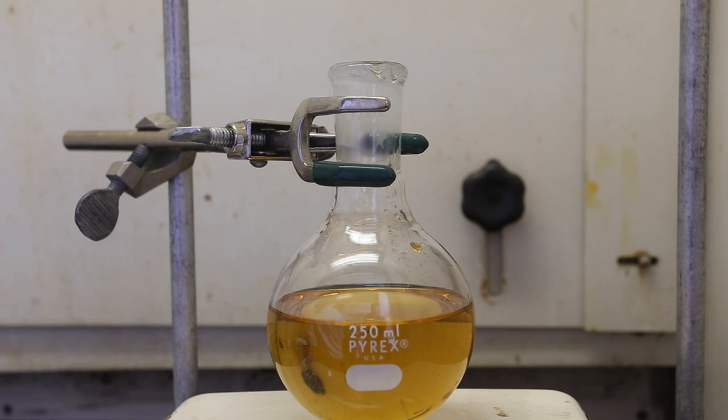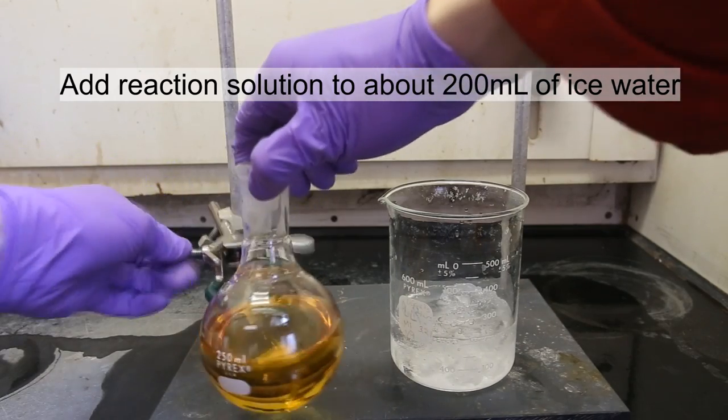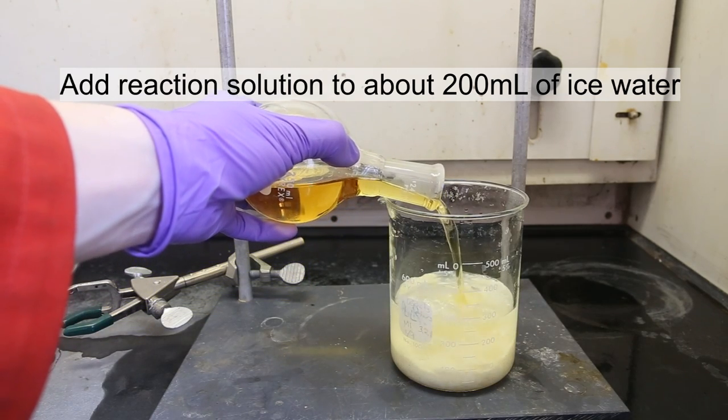Once the addition of the nitration mixture is complete, let the solution sit for about 40 minutes. Do not let it sit for more than 40 minutes, as degradation of the product can occur, or denitration can occur as well. After 40 minutes, pour the solution into 200 milliliters of ice water. The product is insoluble in water and should precipitate immediately upon addition.